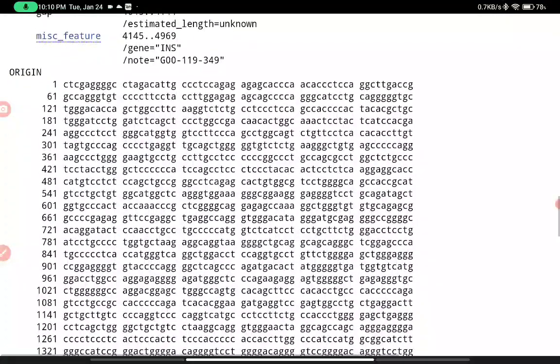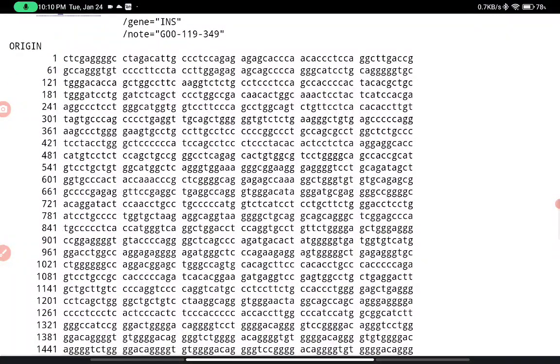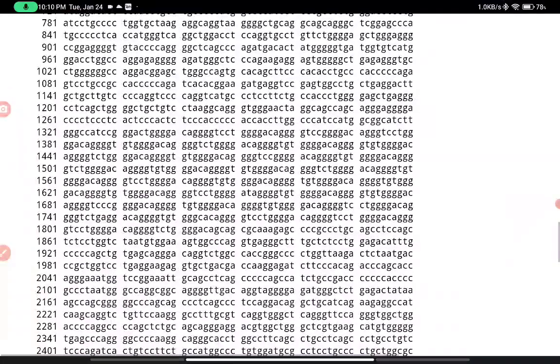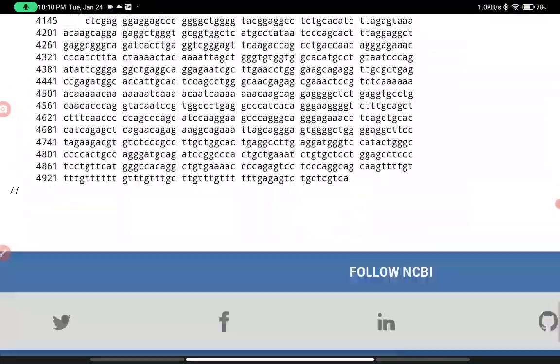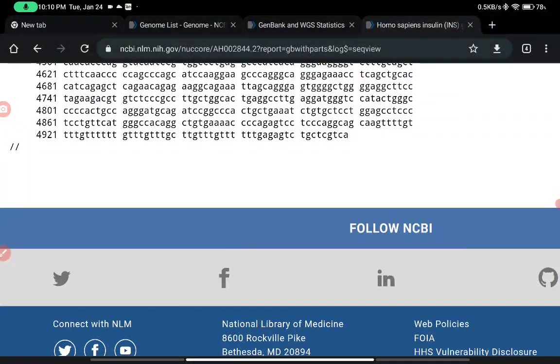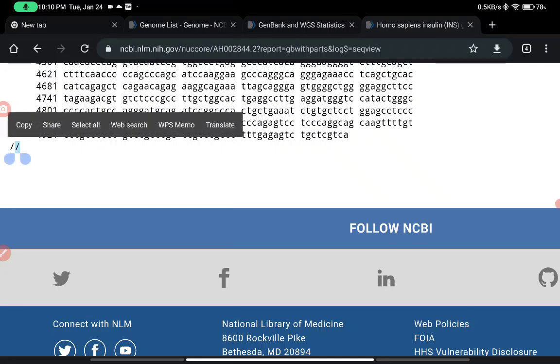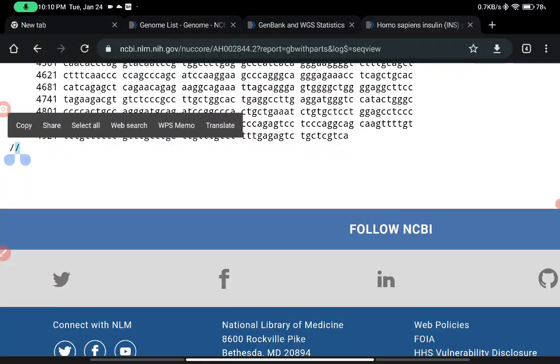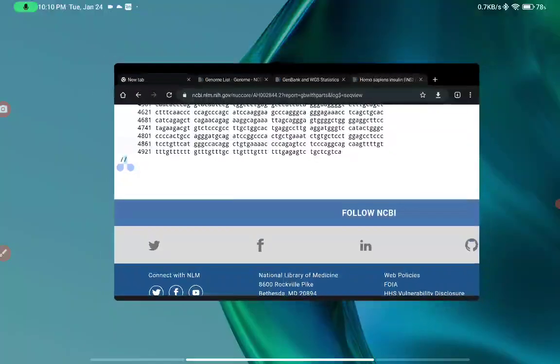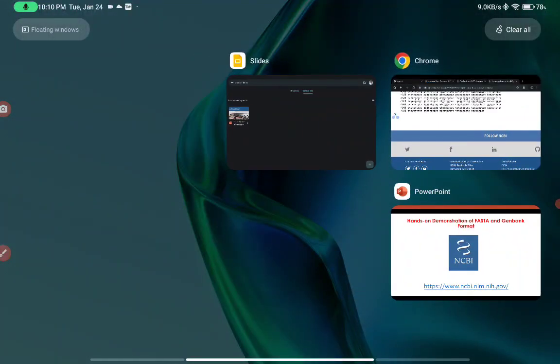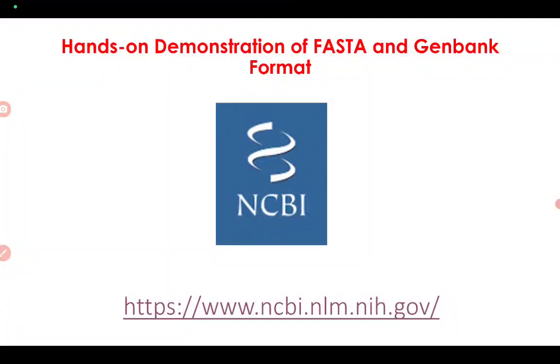The third section is the sequence information itself, starting at position 1 and ending at the 60th position, then 61 onwards. There is also a double forward slash at the very end, which represents the end-of-record indicator in GenBank format.